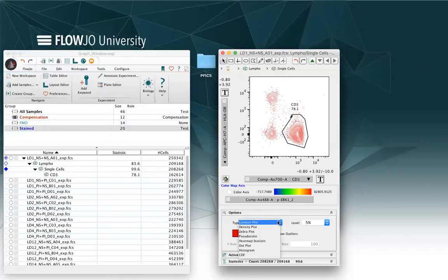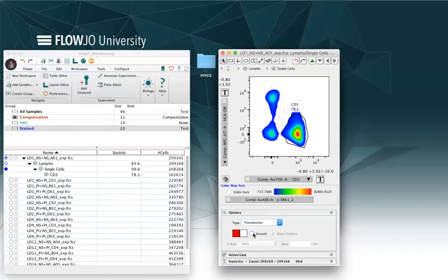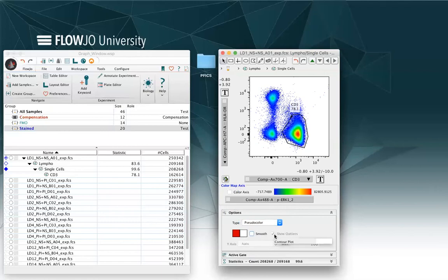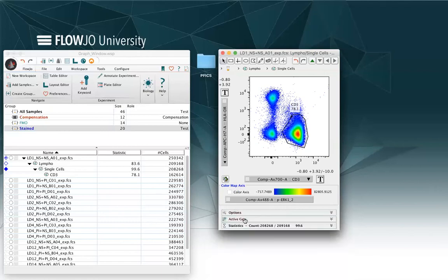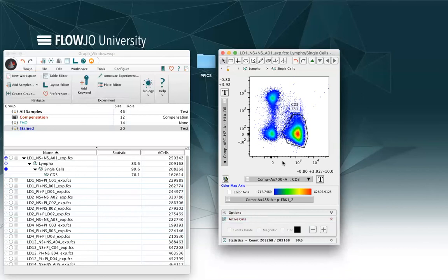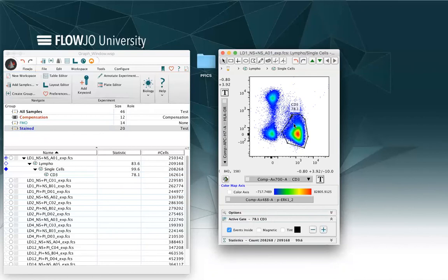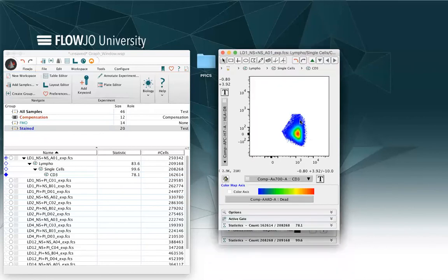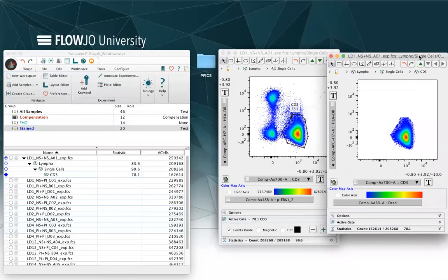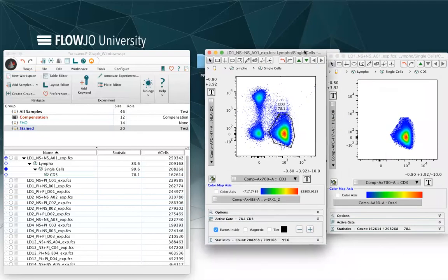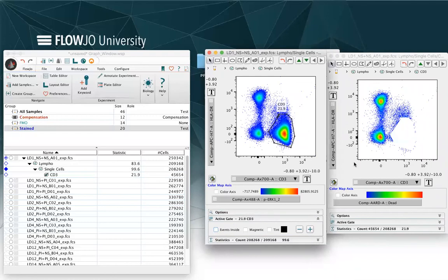So I will just go back to my pseudo color without smoothing. And within my active gate window, if I select the gate, I can choose to see the events inside the gate or the events outside the gate. The difference will be when I have selected inside the gate, if I double click on it, we'll see what is inside the gate. While if I deselect events inside, I will see what's outside of my gate.